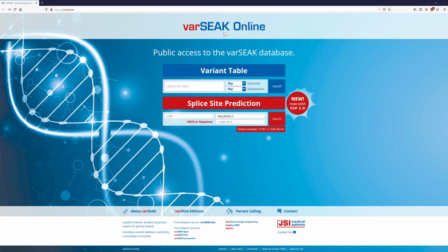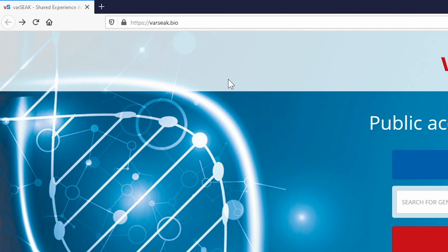Hello and welcome to our today's journey through the newest version of our Splice Site Prediction Tool, version 2.0. A part of varSEAK, our software for variant interpretation and shared experience and knowledge. My name is Gabi from JSI Medical Systems, a German bioinformatics company providing software solutions for sequencing analysis and variant interpretation. To access the Splice Site Prediction Tool, we first open the web link varSEAK.bio.